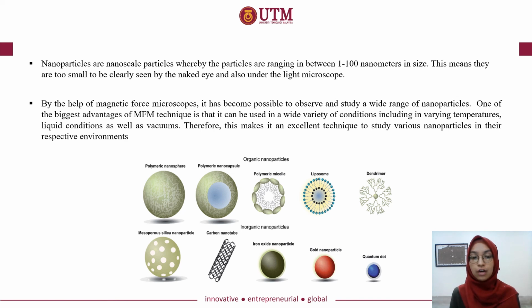Hence, with the help of the magnetic force microscope, it has become possible to observe and study a wide range of nanoparticles. One of the biggest advantages of the MFM technique is that it can be used in a wide variety of conditions, including varying temperatures, liquid conditions, as well as vacuums. Therefore, this makes it an excellent technique to study various nanoparticles in their respective environments.